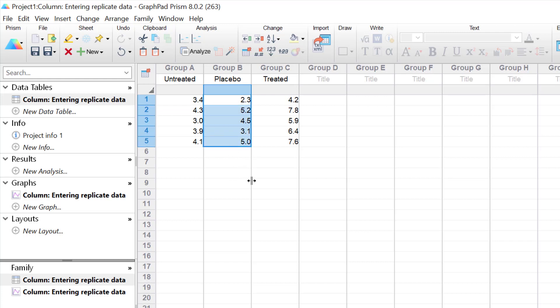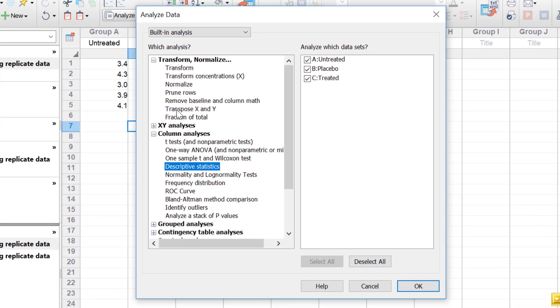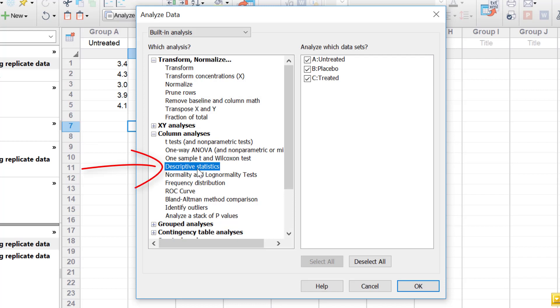To obtain descriptive statistics within Prism, you want to go to the Analyze button and click it. Then under Column Analyses, scroll down to see Descriptive Statistics and select it. If you have a sub-column table or an XY table, you can also click Descriptive Statistics under Column Analyses. On the right-hand side, check each group that you want descriptive statistics for, then click OK.